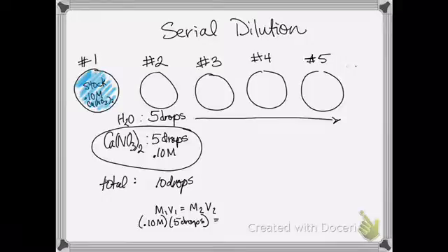One of the things you can do in the dilution formula is, if you use liters on one side and liters on the other side, then you're good. You can use milliliters on one side and milliliters on the other side, and you're fine. In this particular case, we're going to be using drops. It's okay to do that because it's still going to give you an accurate determination of the second molarity. We don't know what M2 is, but we do know that the final volume of that diluted solution is technically going to be 10 drops.